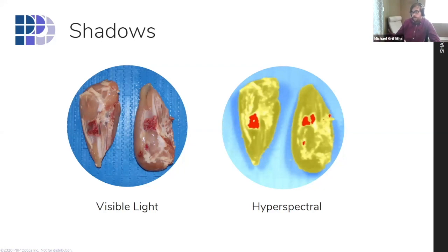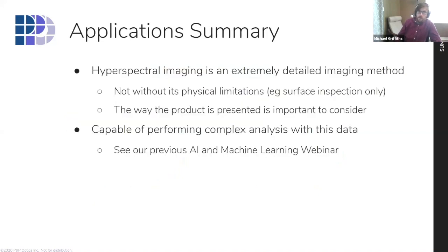So factors such as lighting need to be taken into consideration when designing the experiments for developing models, as things like shadows happen in the physical world all around us, and as long as you have a light source and an object, it's going to be unavoidable. So overall, hyperspectral imaging serves to produce a very detailed image, specifically in terms of the spectral component.